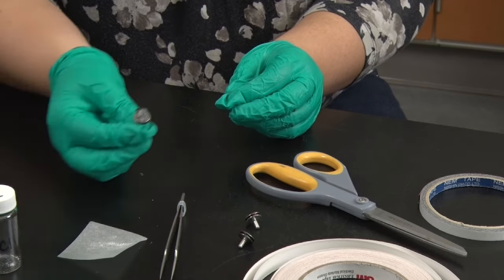Samples that are not conductive need to be coated with a conductive coating for traditional SEM imaging in order to prevent charging problems. Our lab uses a sputter coater to deposit a thin layer of gold palladium, but some labs use a carbon coating instead. I'll place the sample in the sputter coater.